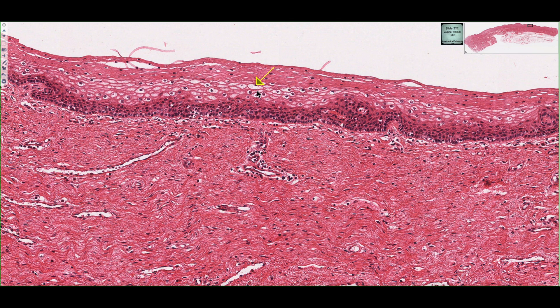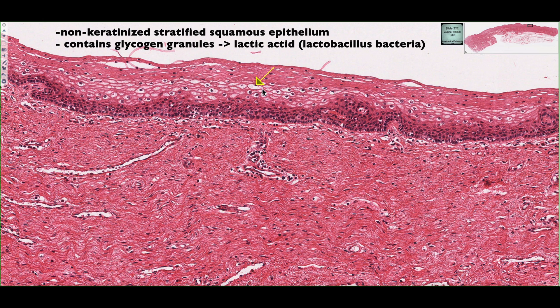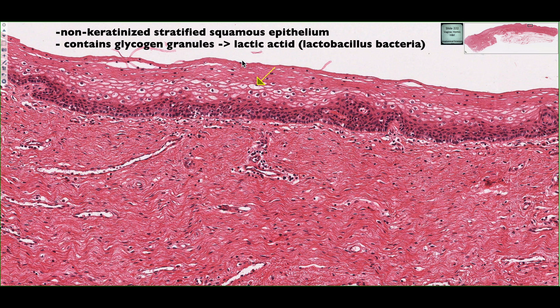This arrow is depicting an epithelial cell where we can see all this evacuated white space. This space is actually filled with glycogen granules, and we can't see the granules because they are removed through H&E staining and processing.